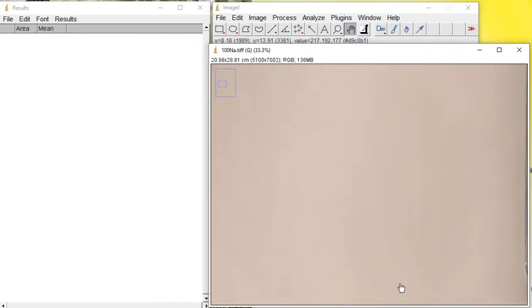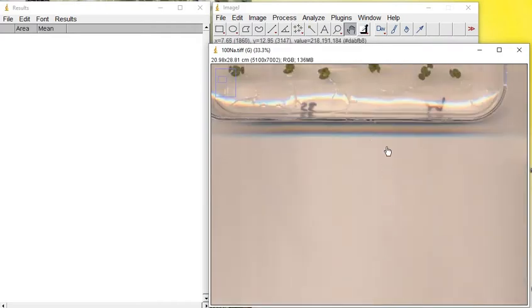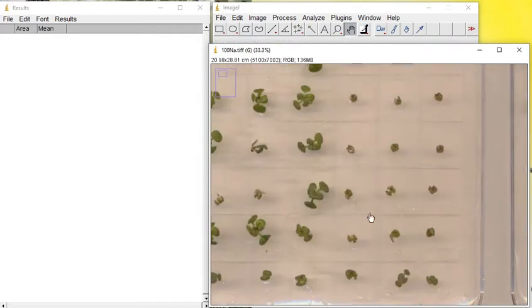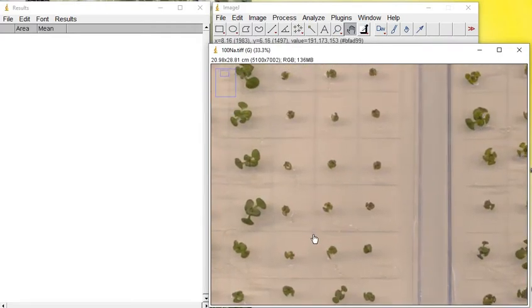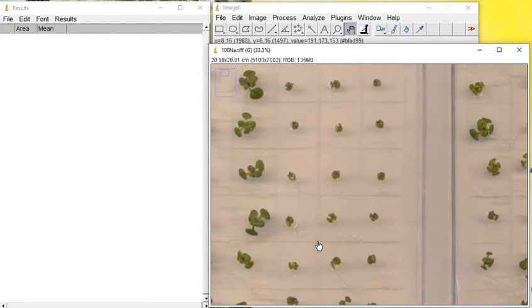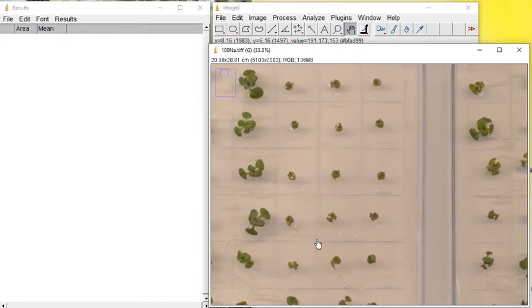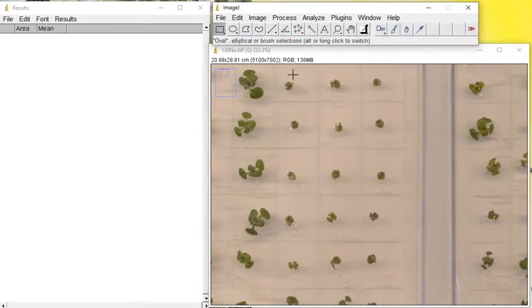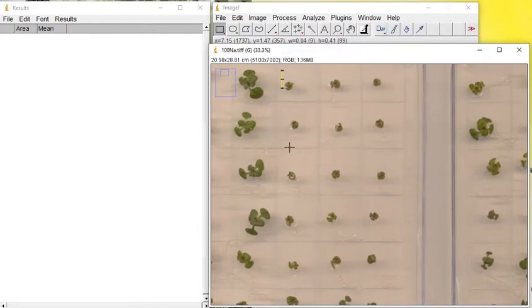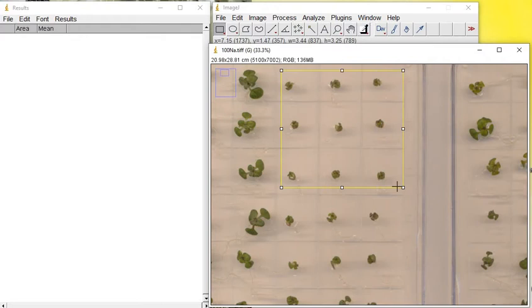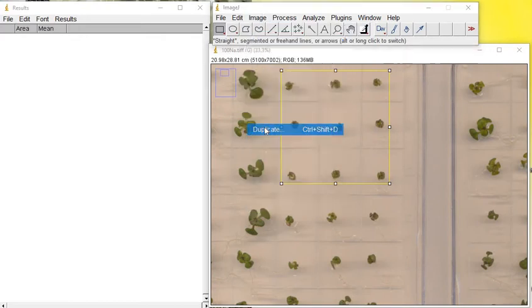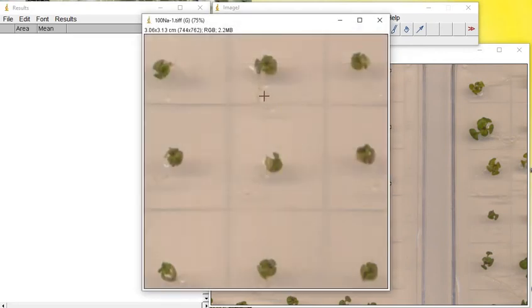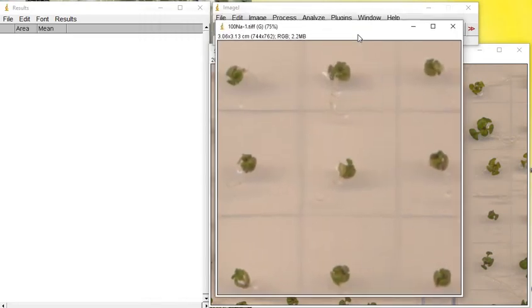Now let's move on to one of the sections. I'm going to measure the rosette area, so I prefer just duplicating these sections for my purpose. When you go to Image, Duplicate, click OK, then only that section will get duplicated.